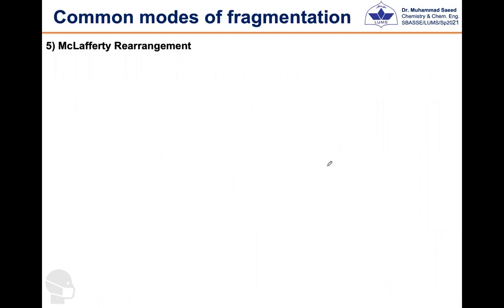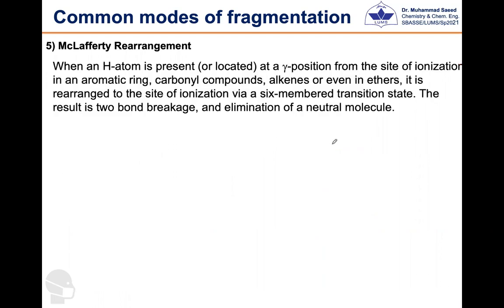Okay. Now the fifth mechanism is McLafferty rearrangement. McLafferty rearrangement के लिए एक स्पेसिफिकेशन होनी चाहिए। वो स्पेसिफिकेशन ये है कि you should have a hydrogen atom at the gamma position of the site of ionization.